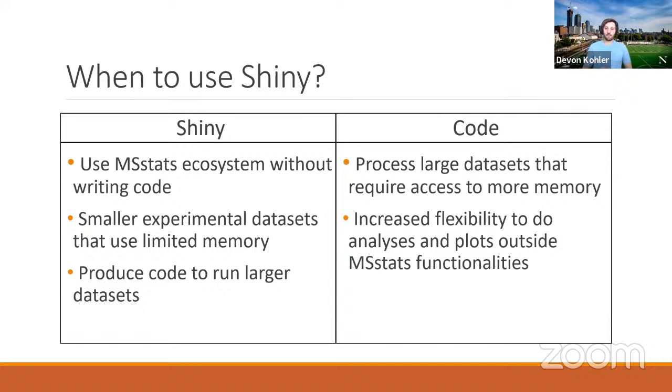It's really good, even if you did download it locally, it still is better for experimental data sets that use limited memory. The app itself, just because it's a UI application and not code, generally takes up some RAM on itself before you even start processing the data set. So it does require you to have some overhead RAM to begin with. And so it really does work better for smaller experiments that aren't going to take up all the memory on your computer.